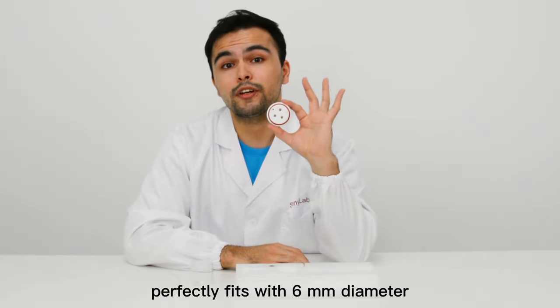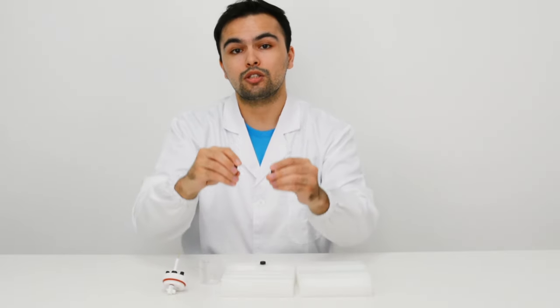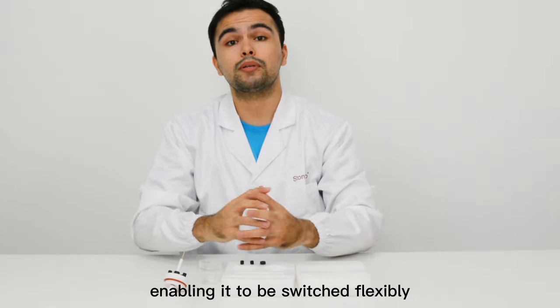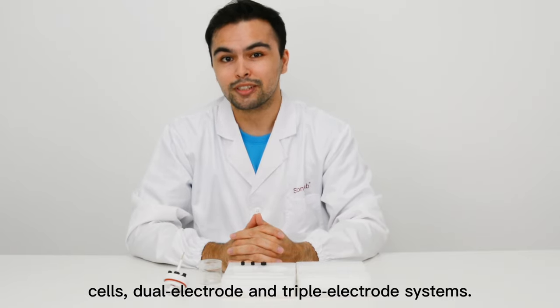The large hollow screw perfectly fits with 6 millimeter diameter, with one large and two small solid screws as a replacement for the hollow ones, enabling it to be switched flexibly between sealed and unsealed electrolytic cells, dual electrode and triple electrode systems.